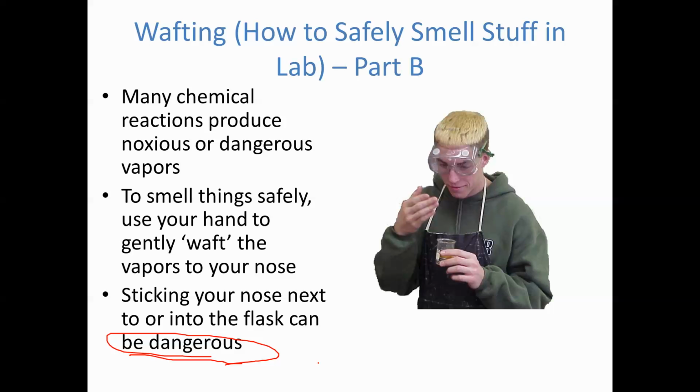So what's the proper way to smell a reaction that may be producing some kind of dangerous vapors? You want to hold it pretty far from your nose and use your hand to gently waft the smell up to your nose. So again, waft, you're going to wave your hand. And if you look at the picture here, you can kind of see the blurs.